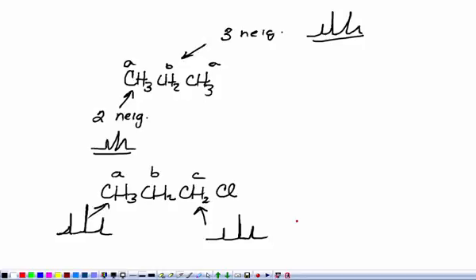What about the one in the middle, the CH2? Well, the CH2 in the middle, B, is actually not going to be a singlet, doublet, triplet, or quartet, because it has two non-equivalent groups attached to it. It's got a CH3 group on one side, and it's got a CH2 group on the other. Now we can estimate the number of peaks that should show up for that by adding up the total number of neighbors. And so if I add up the total number of neighbors for the CH2, I've got 3 on one side, 2 on the other, which means that for the estimate, I have a grand total of 5 neighbors, and that means that I would have 1, 2, 3, 4, 5, 6 peaks. Okay, I'm going to have a 6 peak pattern.